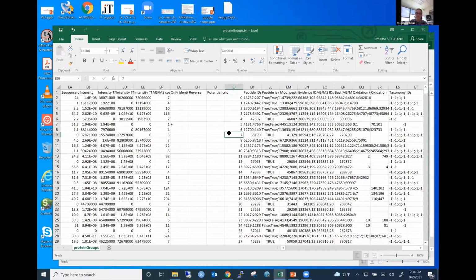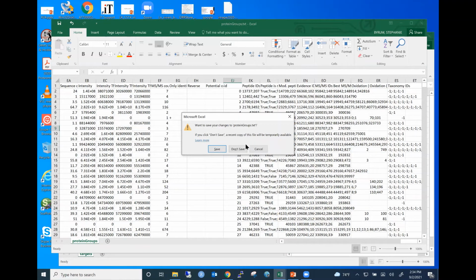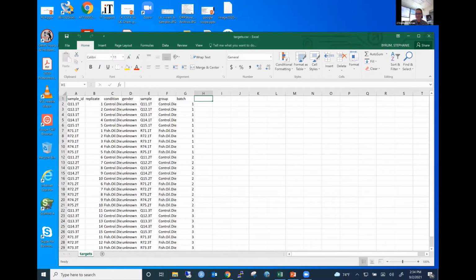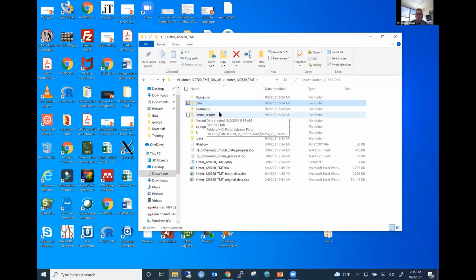We don't have that yet for the intensity level, but I utilize the MD plot to look for those. Then we can set a threshold with that plot if we need to remove some of those lower abundant ones. But there's not really a set threshold for filtering on that level yet. Great, thank you. But there should be, I think. It's just that abundance issue. Yeah, we don't have one either. I don't really filter on low intensity, so I was just wondering if you guys do. Yeah, no, not yet.